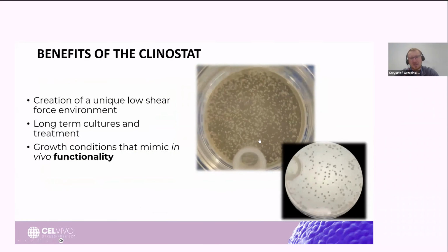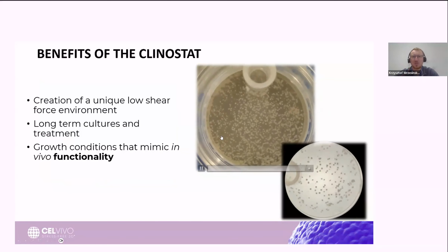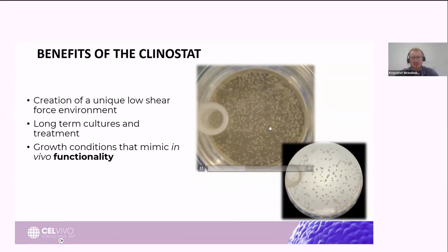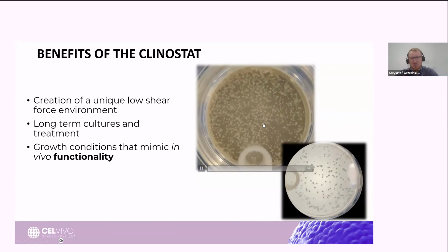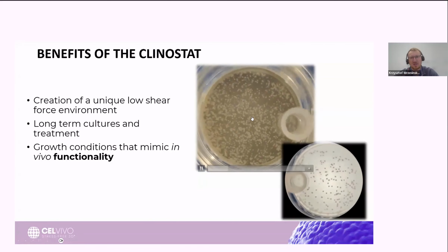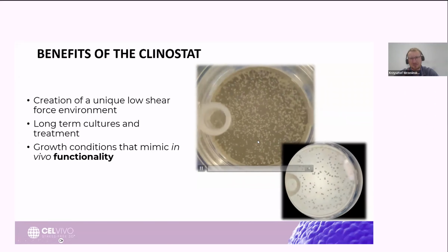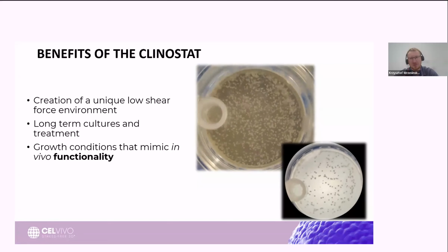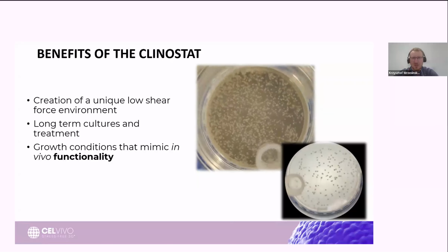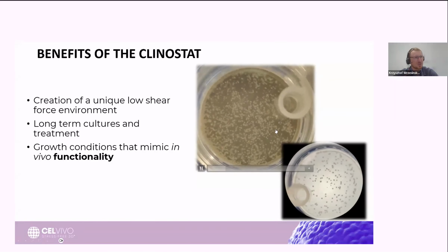So in clinoreactors, we create an environment with so-called omnidirectional gravity stimulation. What this means is that once the uplift due to the movement of the growth media matches the downpull of gravity, our 3D constructs will be kept in essentially shear stress-free suspension and will appear to be in a stationary orbit, as here.